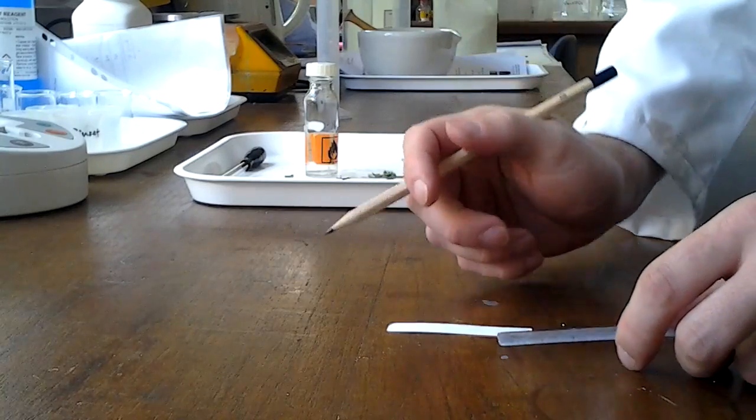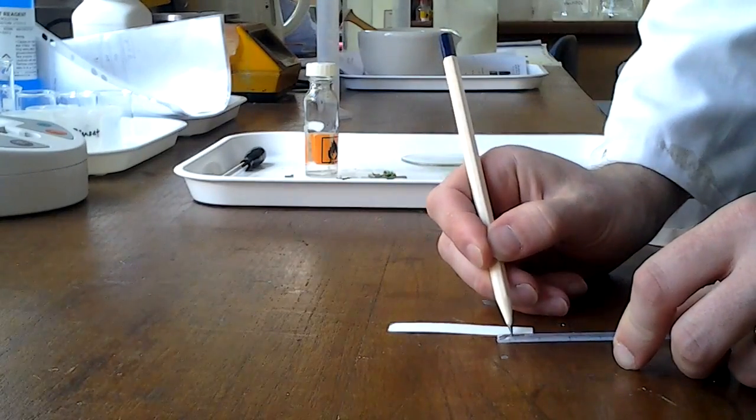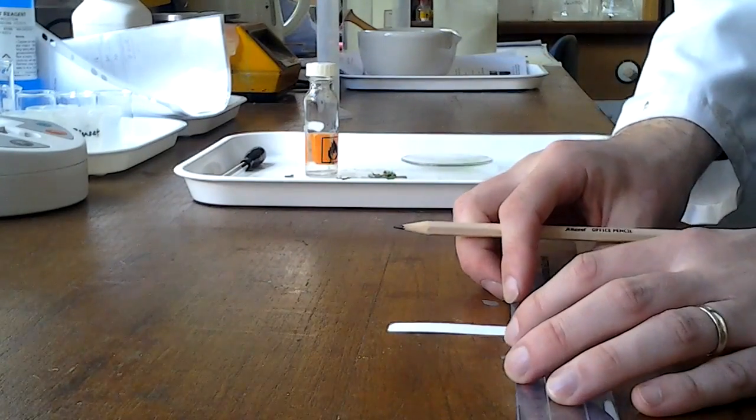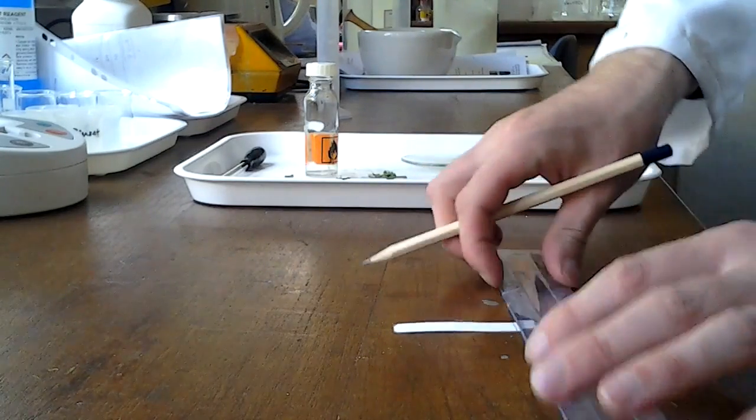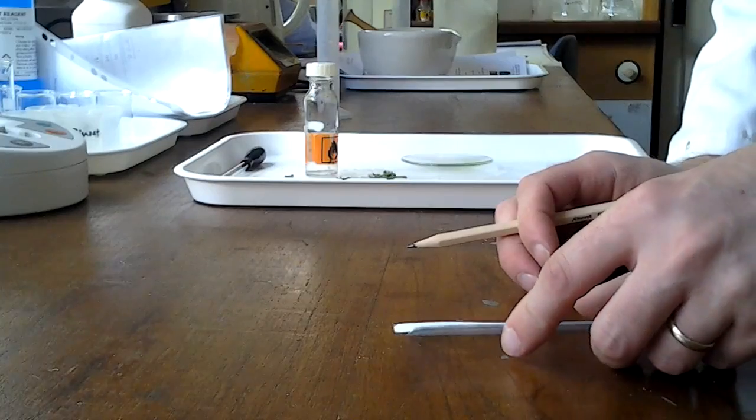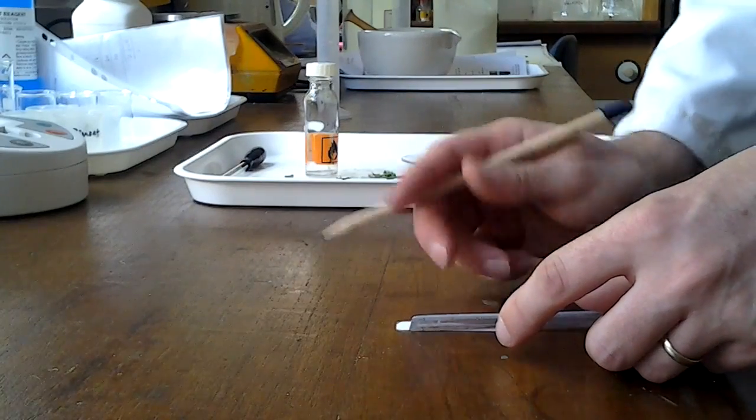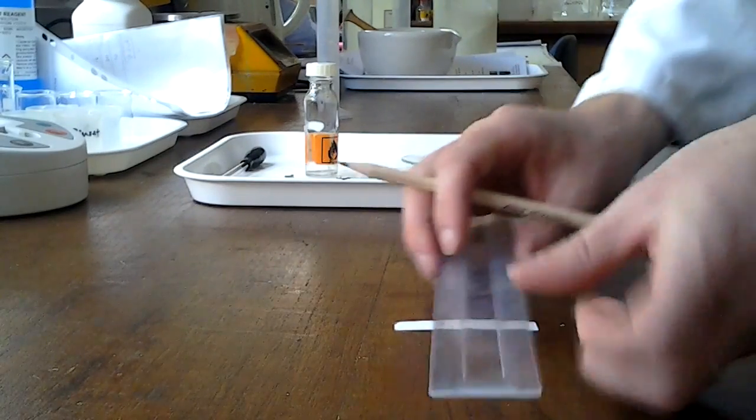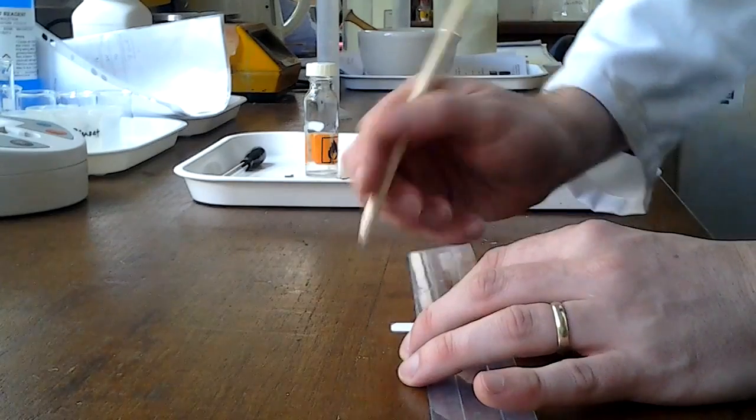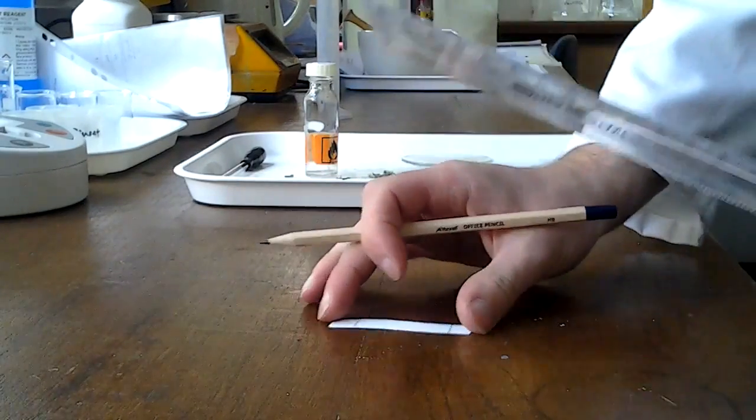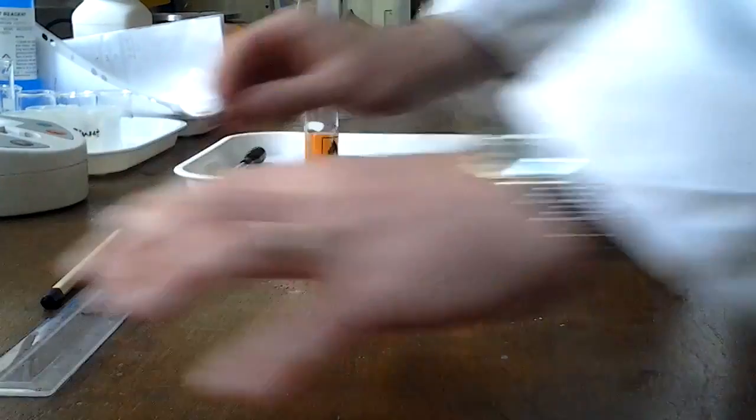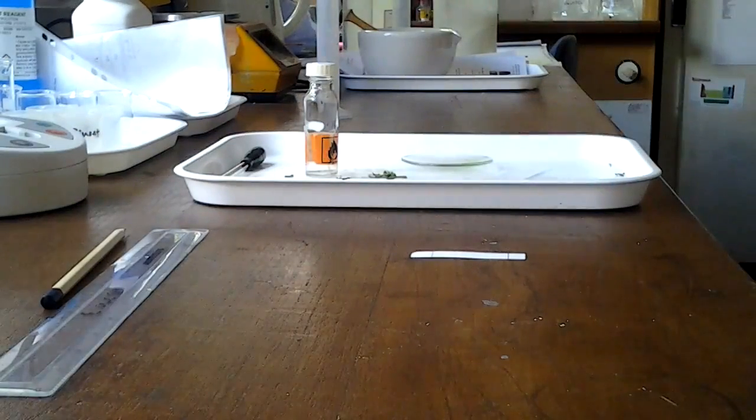So we need to set it up with a start and finish line. I'm going to just draw a line across the bottom in pencil, one centimetre from the bottom, and then four and a half centimetres, or 45 millimetres if you prefer, from that, we're going to have our finish line. That's now all set up to run our pigments on.